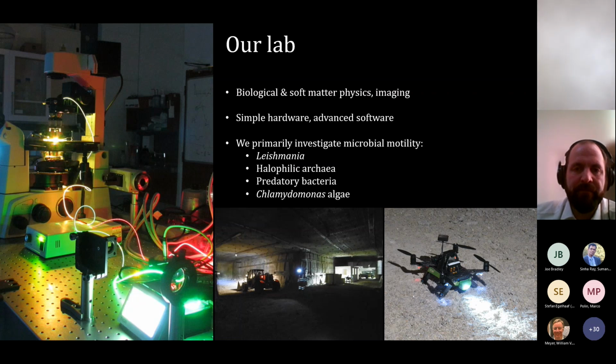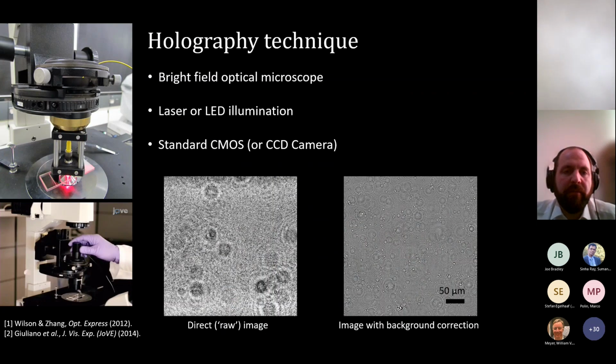So this is a holographic microscope. This is what it looks like. It's based on a simple inverted microscope in our lab, but we replaced the light source with something a bit more coherent, so either a laser or an LED.